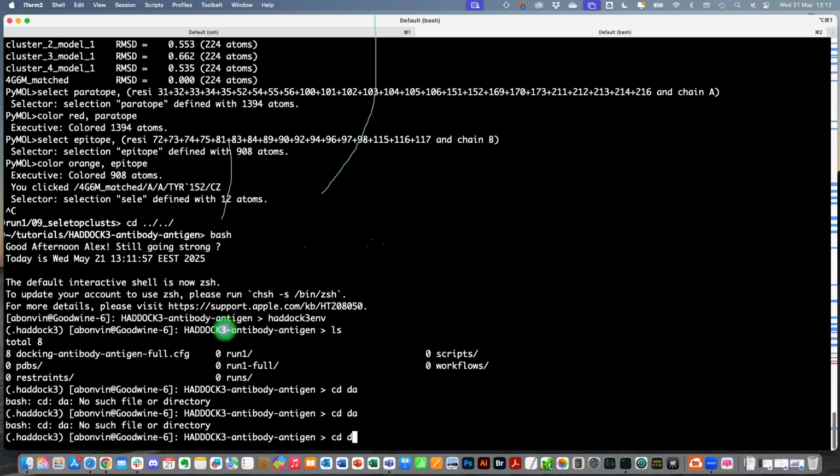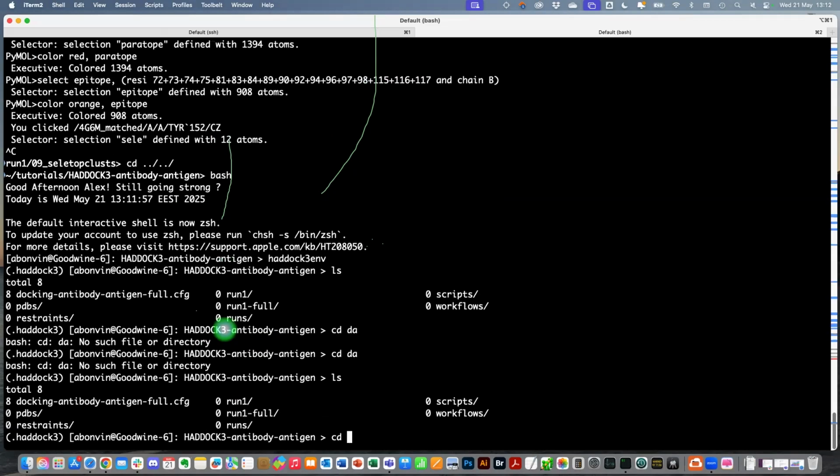If you do a mutation, typically what you want to do is a minimization or maybe a flexible refinement. So we have an EM-ref module, and we have an MD-ref, which will put water and do a bit more refinement. So you're not doing docking, you're just refining. And this might be able to remove clashes. If they are really bad clashes, the system might explode. Energy minimization is quite stable, so you can always minimize. Molecular dynamics is where the explosion takes place. So you want to put a minimization first.